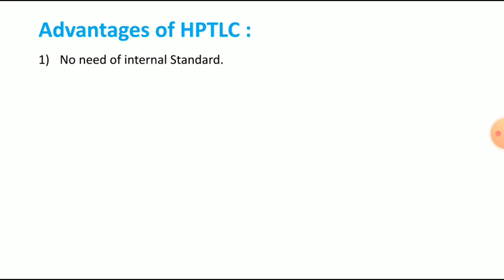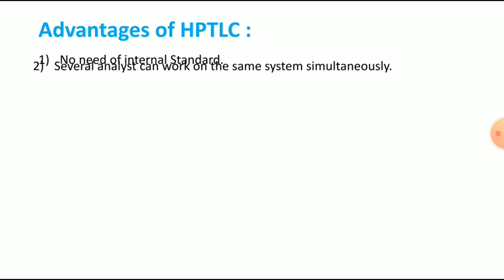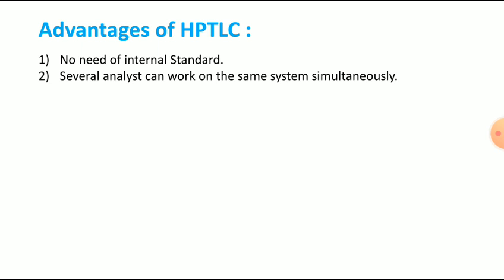That is the advantage of the HPTLC. Second one, several analysts can work on the same system simultaneously. That means many chemists or analysts can work on the same system simultaneously.